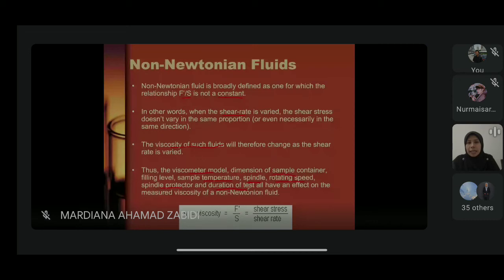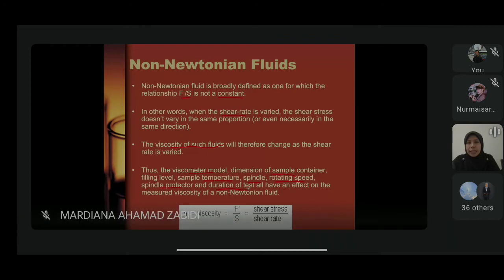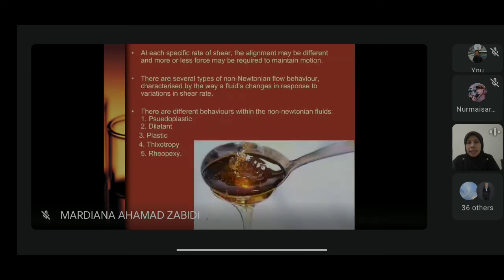When you are measuring Newtonian fluid, you will not have any kind of this particular problem. But when you are measuring non-Newtonian fluid, so these are the factors that you need to consider in order for you to perform viscosity measurement. Okay, so just now I dah bagi tahu kan, sama ada you guna eta ataupun mu, okay, untuk symbolize viscosity. Selalu kita pakai mu lah.